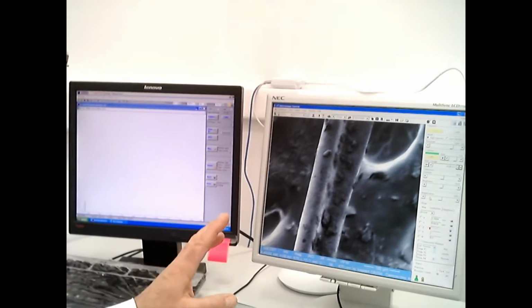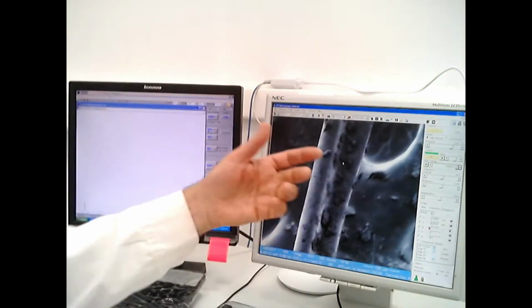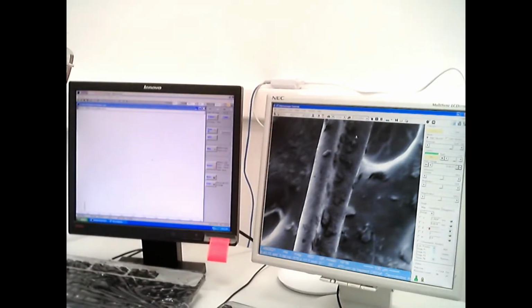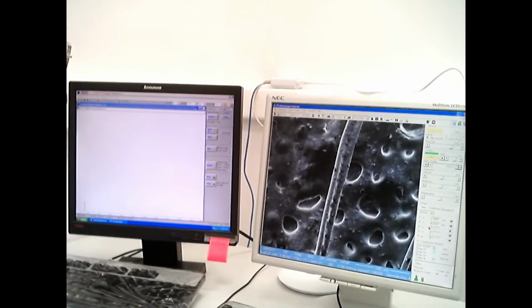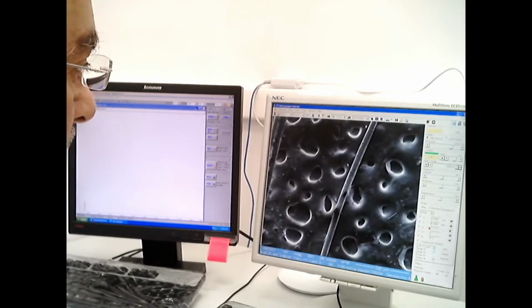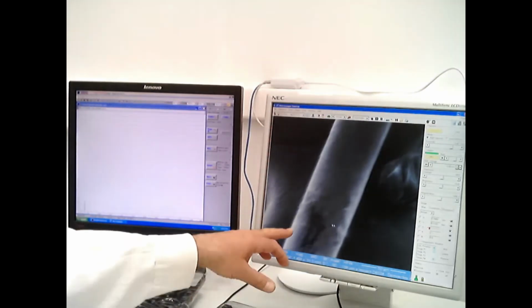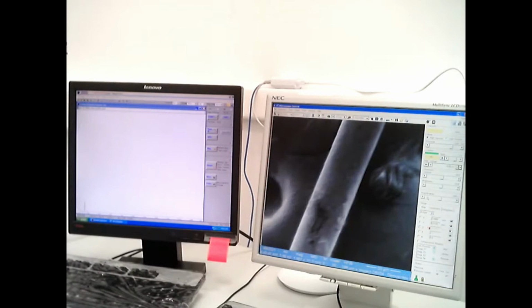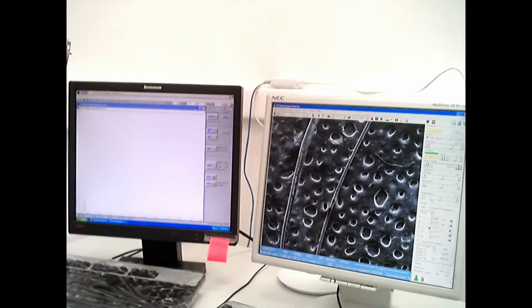There is some rubbish on it, some things that were stuck on it, probably skin, so we can analyze this skin as well. Next to it, there's another hair, which looks similar. Let me have a look. This may be human hair. Let's focus it a little bit. The magnification is 1500. It's not easy to focus, but it looks human. Let's see another hair, and it's a much thinner hair, and I have a feeling that this is a woman's hair.